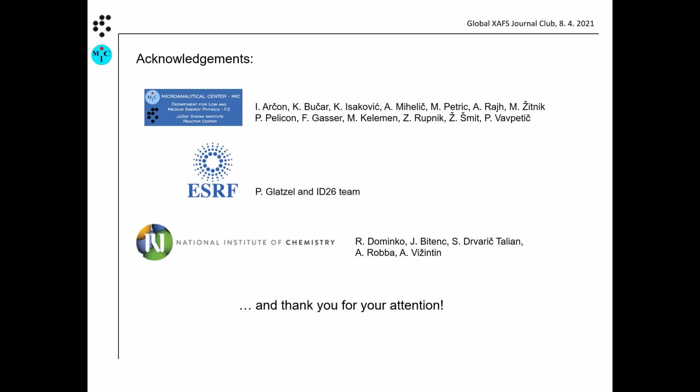Sorry, I was more wondering about the shorter time range, so let's say pico or nanosecond range. Yeah, but we don't have such a source. I'm not so familiar with time resolved studies, but I have seen some work in the hard X-ray range. For example, Georgi maybe can add something. He has experience there, and I don't see a big difference. So I think in a similar way one could do it also in this range.